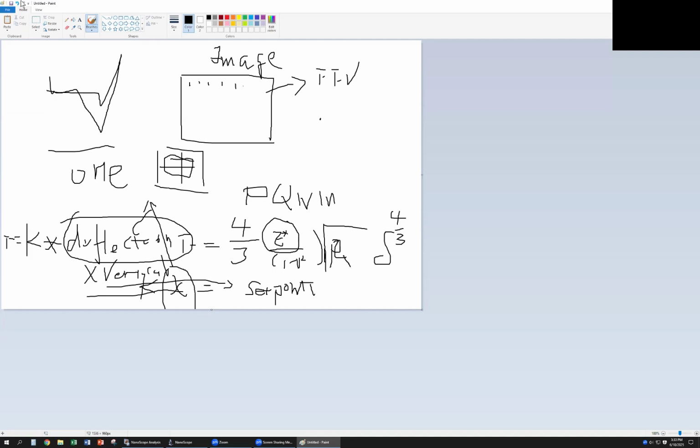Okay, so then we have another box. Inside here we provide one sapphire sample. This sapphire can be used to calibrate deflection sensitivity. But this one will be dirty, so I make another one. It should be clean, should be kept clean. Then for this sample, the same. Okay. So this sample is called the RS sample.